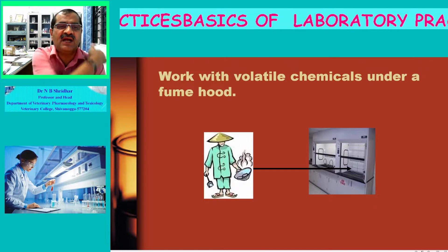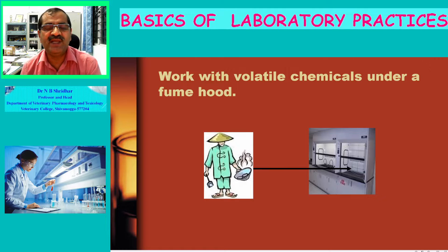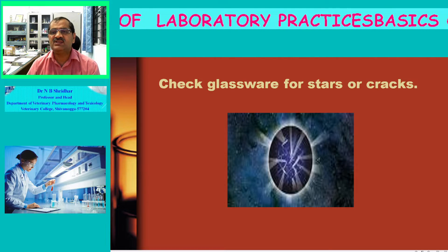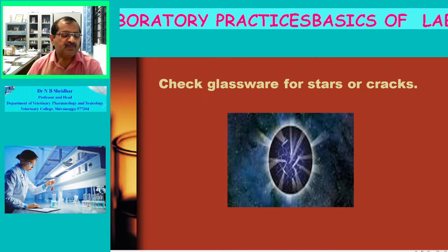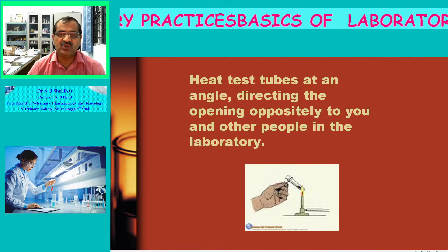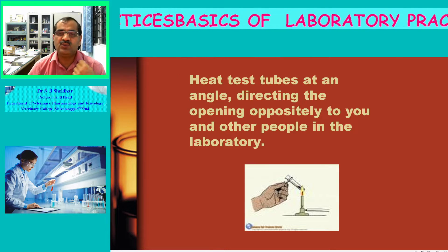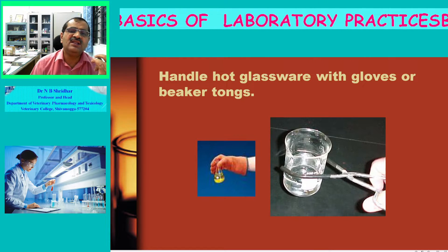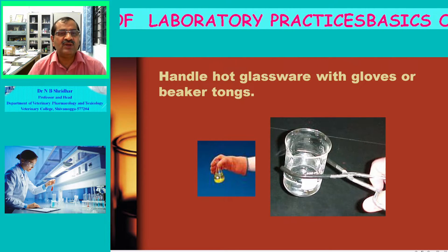Work with volatile chemicals under a fume hood only — never use open areas for volatile chemicals. Check glassware for stars or cracks, as leaks may lead to spills of acid or alkalis. Heat test tubes at an angle, directing the opening away from yourself and other people in the laboratory to prevent spattering. Handle hot glassware only with gloves or appropriate beaker tongs.